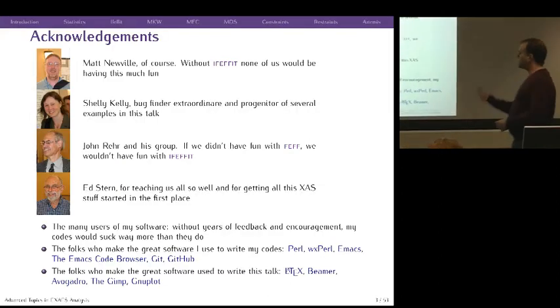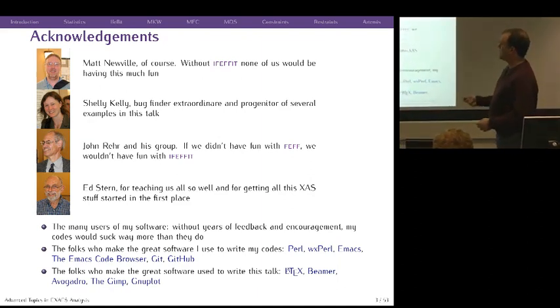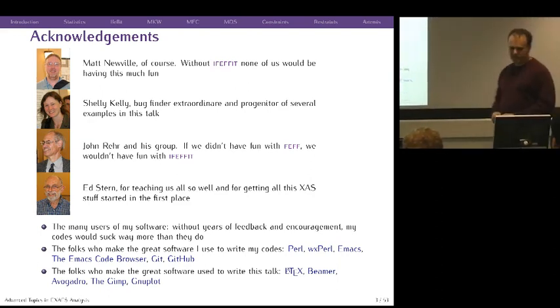All right, same acknowledgments as the other day. Matt, my longtime collaborator, and my teachers, John and Ed, everything I'm going to present here is thanks to those folks, and of course, thanks to all of you who use my software and help improve the state of things.